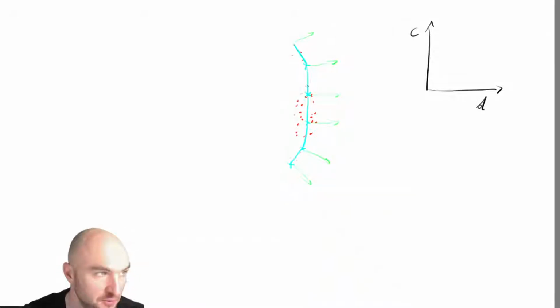Or would it make more sense if I do two proxigrams, maybe one for here and one for somewhere else? The way to do that is to select the area by selecting which area on the surface I want to work on.